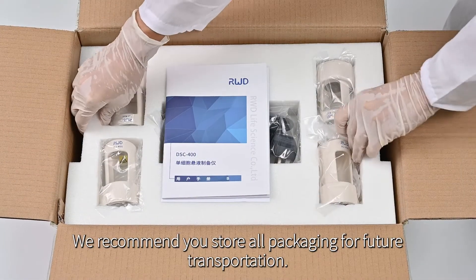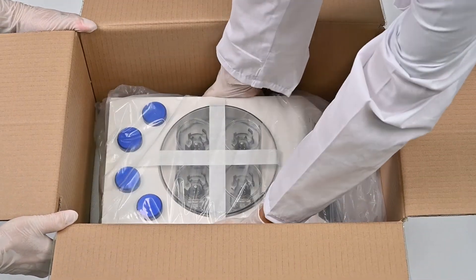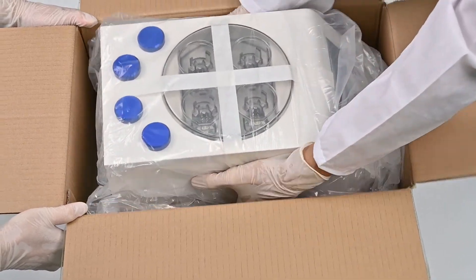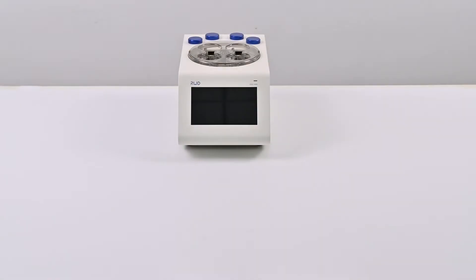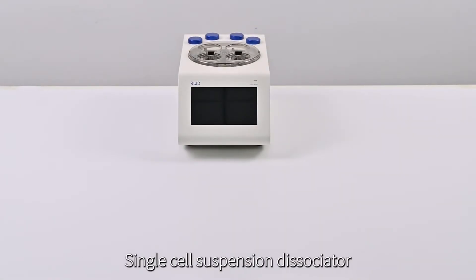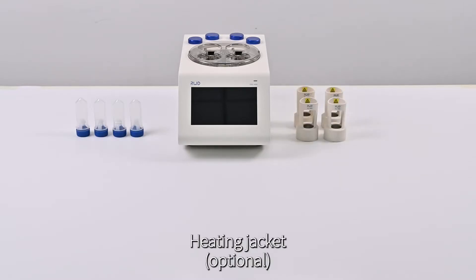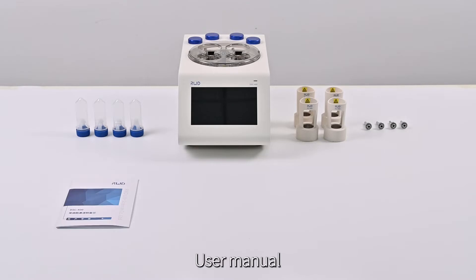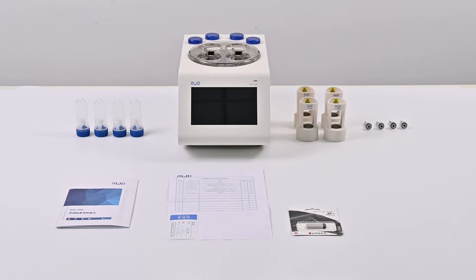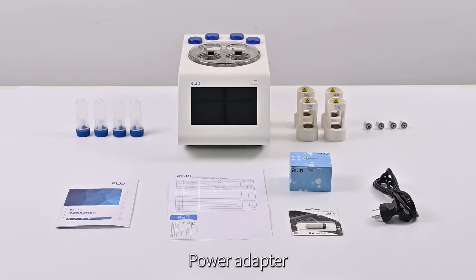We recommend you store all packaging for future transportation. The instruments and their accessories include: Single Cell Suspension Dissociator, Tissue Processing Tube, Heating Jacket, Bushing, User Manual, Packaging List and Certificates, U-Disc, High Activity Tissue Enzymatic Digestion Kit, and Power Adapter.